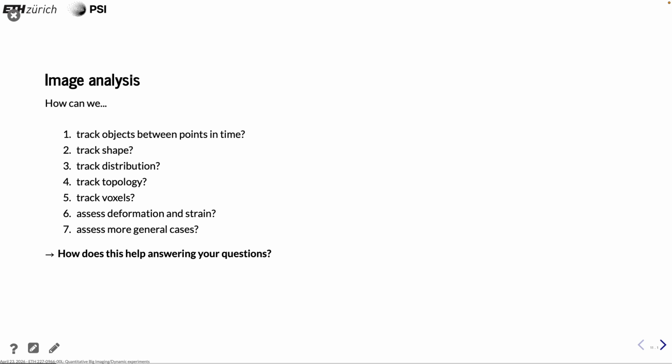So that means we need to do some classification, segmentation to get the items. And then, of course, we run labeling, if it's component labeling or if it's watershed. That depends on how complex the image is. But these are the things that come back now, and we really need them in our toolbox to get to the next step.